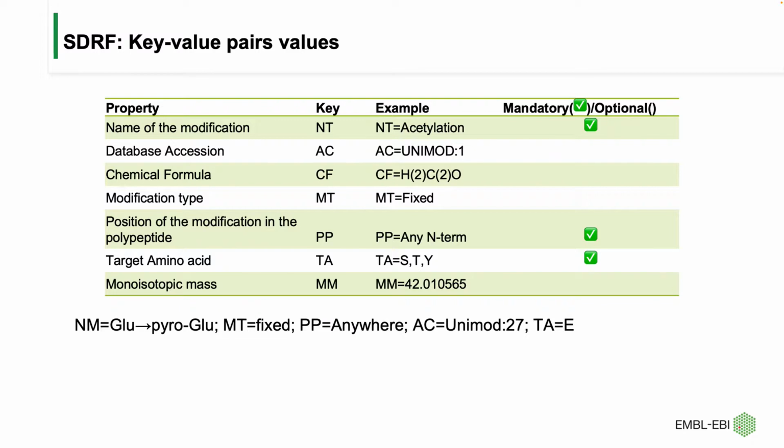Because different from RNA, in proteomics we are interested in exploring what PTMs are present in the sample. Of course, there will be people that say, okay, you cannot express all the possible PTMs that are in the sample in the data file, because if you use open search, you can have multiple PTMs, not only the ones that you normally look for. That is true, but in 90% of the cases, you really know what the main PTMs present in the sample, or in the data file sorry, are, and you want to describe which are those PTMs.